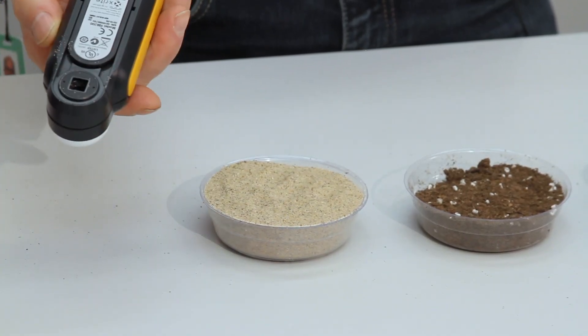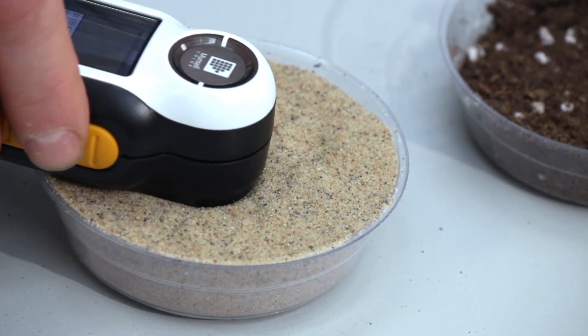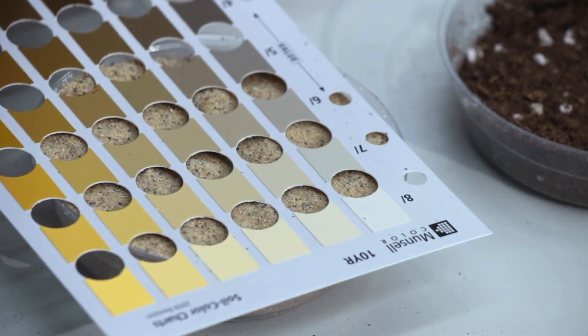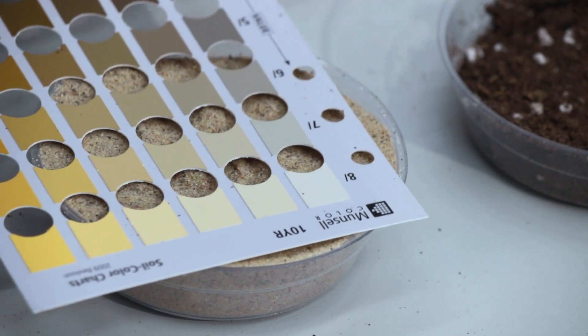Simply take your capture device, place it down on the sample, press the trigger, and take your reading. It comes up with the reading for that color, and if you want to check it, you can always use your Munsell soil book to make sure that it's in the right family. Here we can show that it's reading accurately, and it works very quickly.